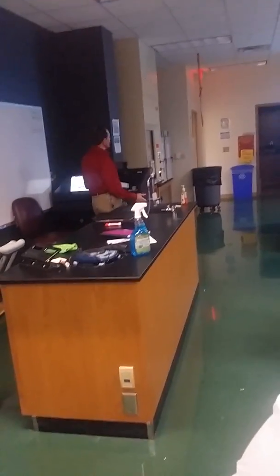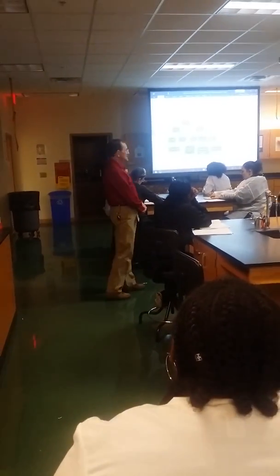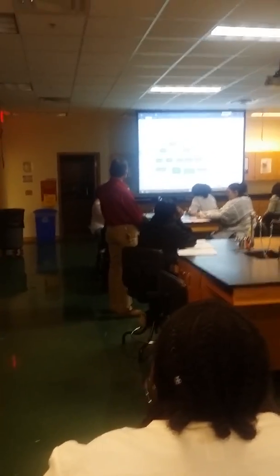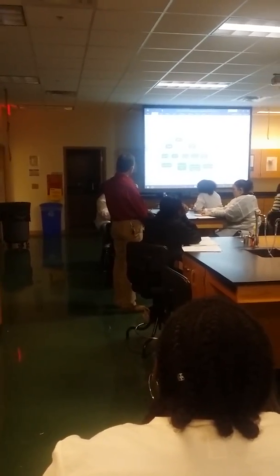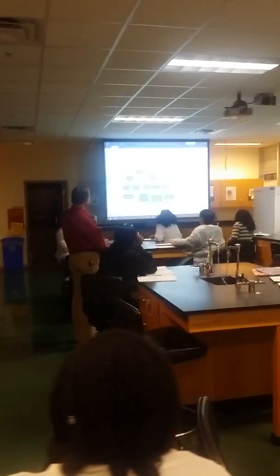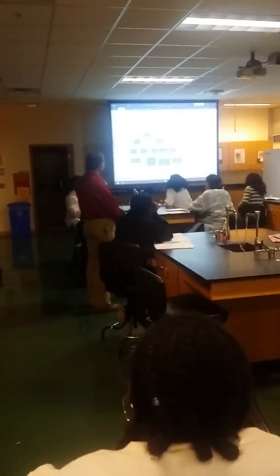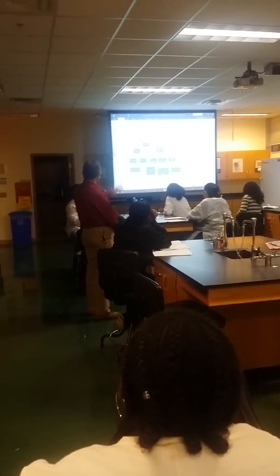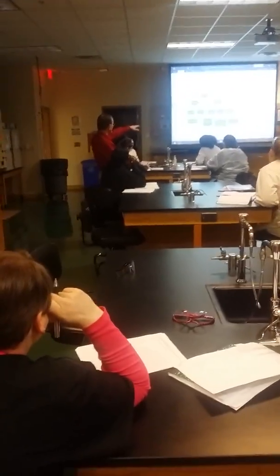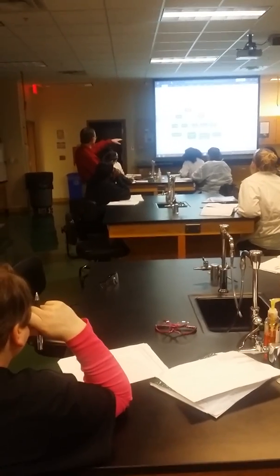You get a gram-positive coccus, you're going to put it on an MSA plate. That's a plate with a lot of salt. Staph aureus, or staph species, like salt. So if it grows on that, then you've got a staph. If it doesn't grow and it's not a staph, you put it on blood agar. Again, you see how much of the sheep's blood that the thing ate, and whether beta, alpha, or gamma hemolysis. If it's gamma, you put it on an EMB plate, growth and no growth, and you got it.